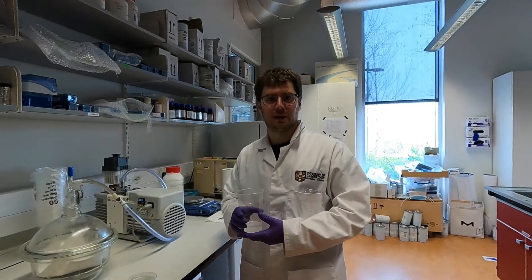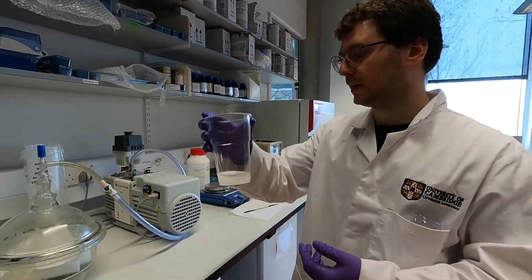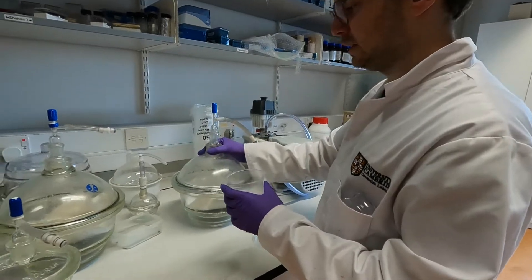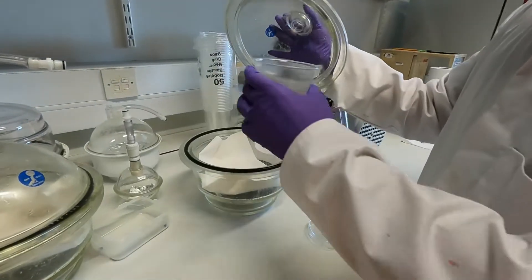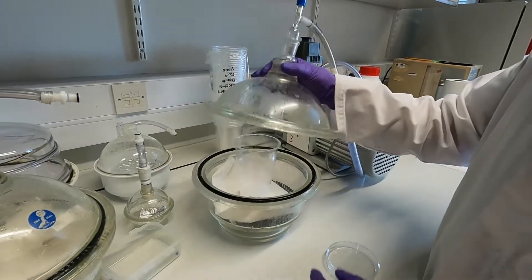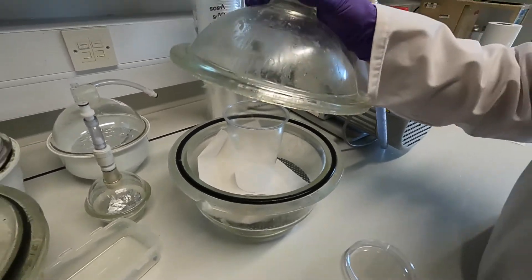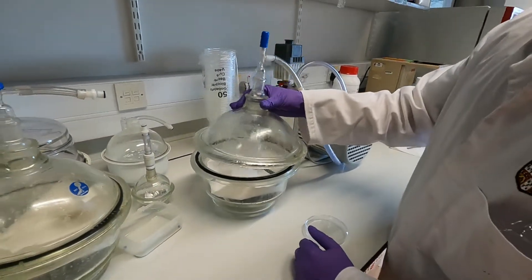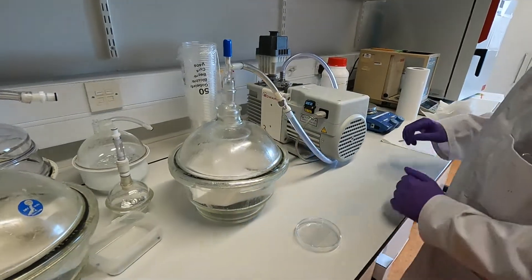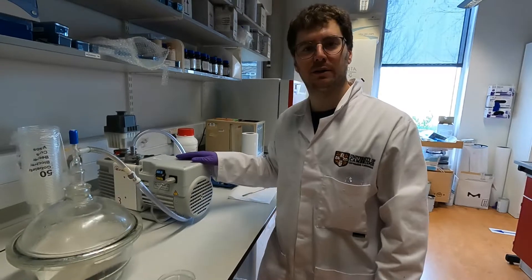We move to a different lab for the degassing step. This is the same cup I just mixed, and for the degassing we're going to put the PDMS cup inside a desiccator — just a sealed container connected to a vacuum pump. Remember to line the bottom of the desiccator with a piece of paper, so in case you spill any PDMS it won't go directly into contact with the chamber. I'm going to close the desiccator and turn on the vacuum pump.